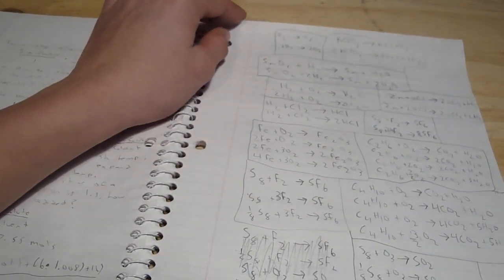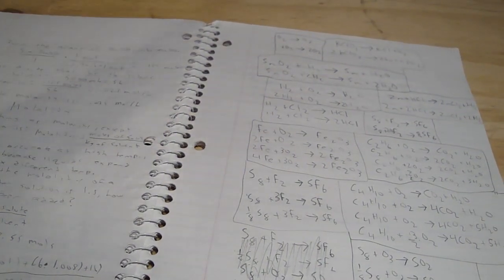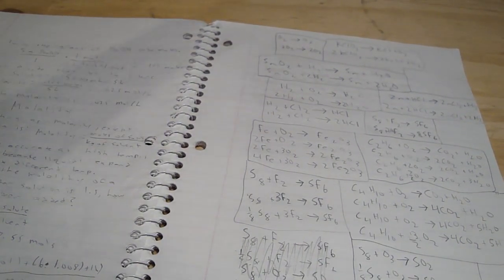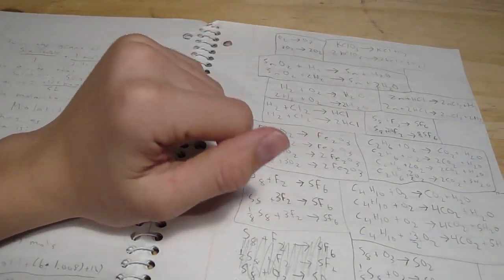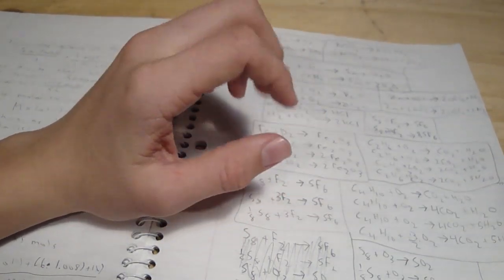Hey guys, this is GooferKing and this is going to be the first video in a little series of videos on how to make a fume hood. I've realized that there are no videos on YouTube on how to make a fume hood — there are videos about homemade fume hoods, but not how-to videos. So I decided I would take on the task of making the first one.